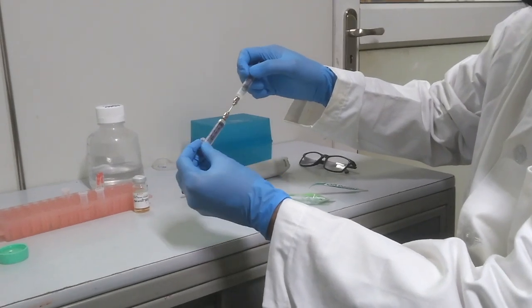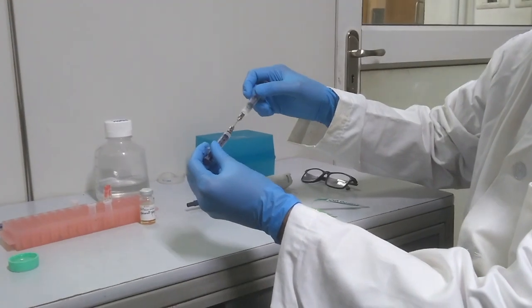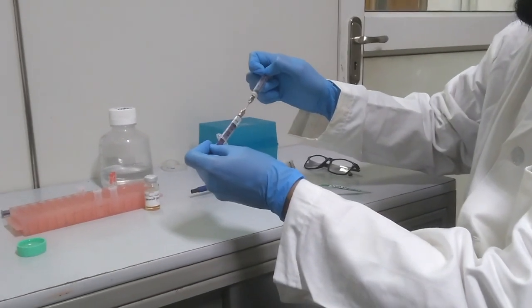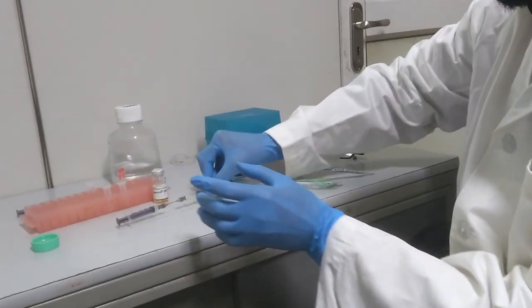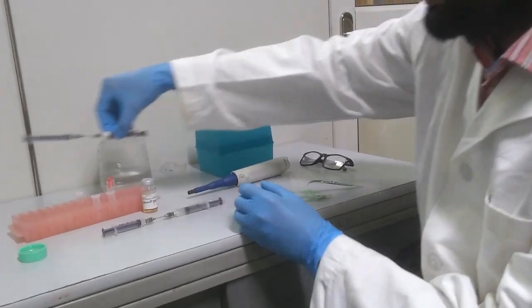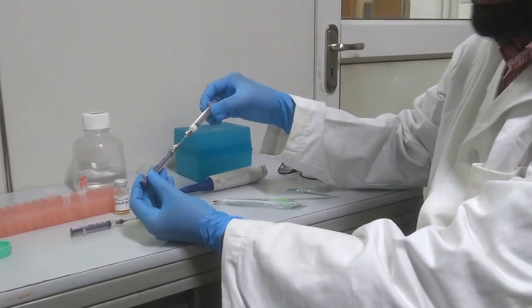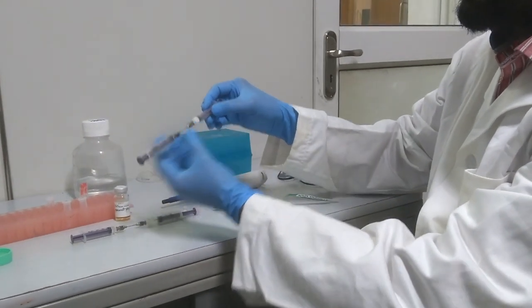Emulsion can be called water in oil or oil in water, because both are in the same concentration and same volumes, so you can call them either way. So this is the emulsion; by this method the emulsion is formed. For ready reference, we have already prepared the emulsion. This emulsion looks white. Initially it was two phase, and then slowly it has turned into a single phase.